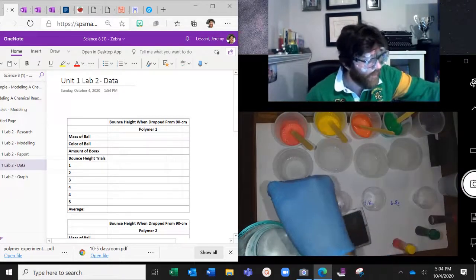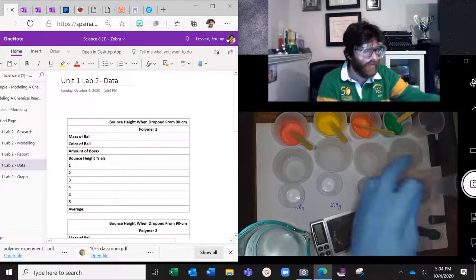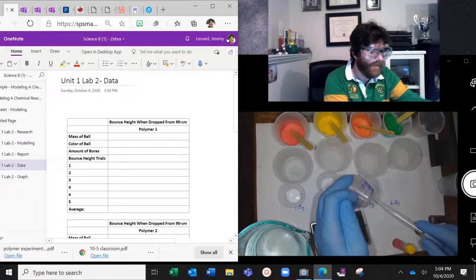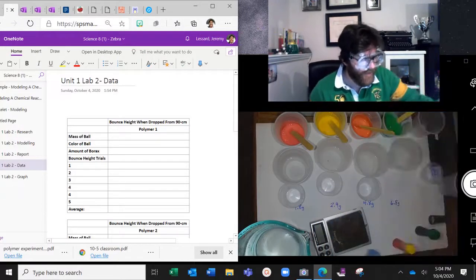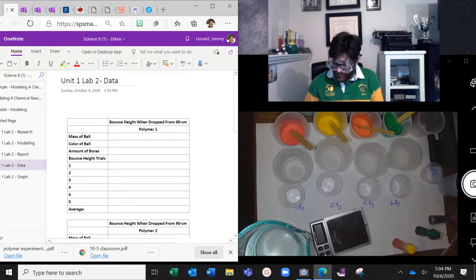And like I said, we're going to measure out 10 milliliters of each of them. 10 milliliters of that solution. And then we'll add it to here to make our slime. So we'll be back in a second to do that.